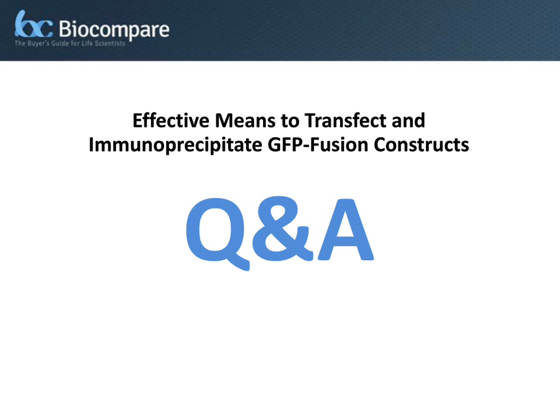Got it. Okay, thank you. Nandan, the next question is for you. In the developing chick embryo, how do you decide when to use electroporation versus other gene transfer methods?